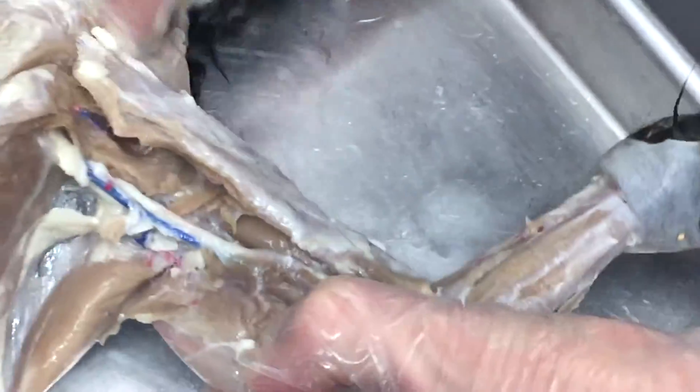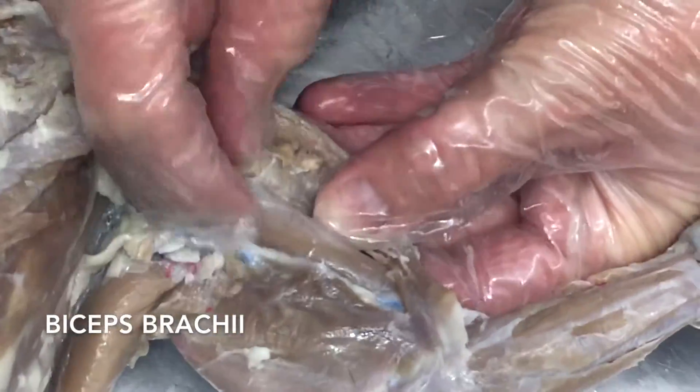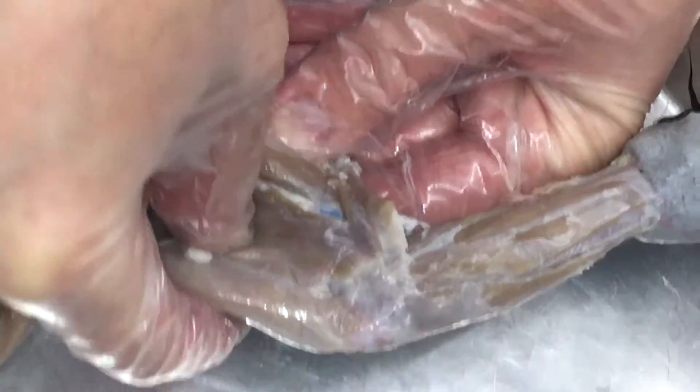If we get the pecto-antibrachialis out of the way and the trapezius a little bit, you can see this is the bicep here — it's this little one. The tricep is this larger one. On the back side, this is the brachialis muscle.